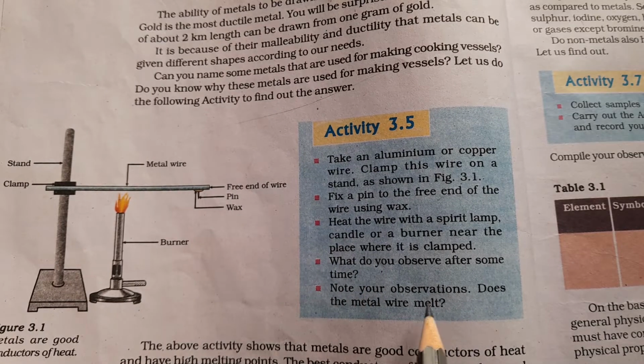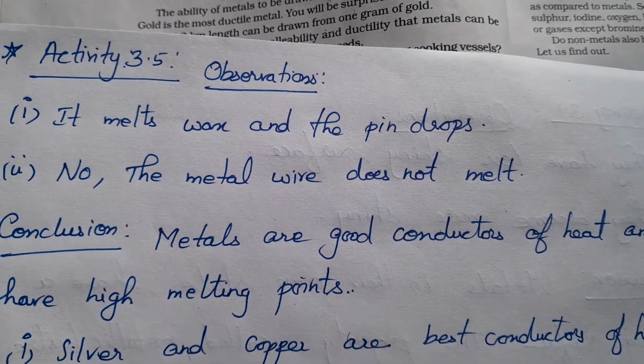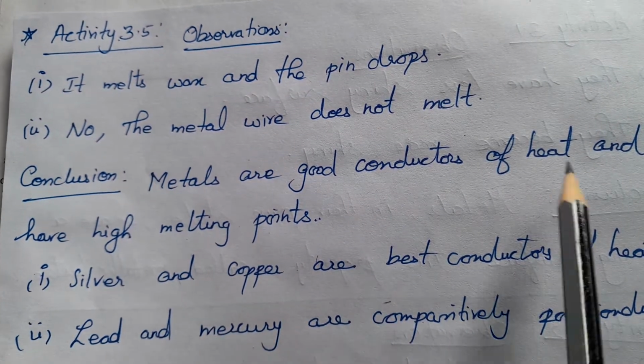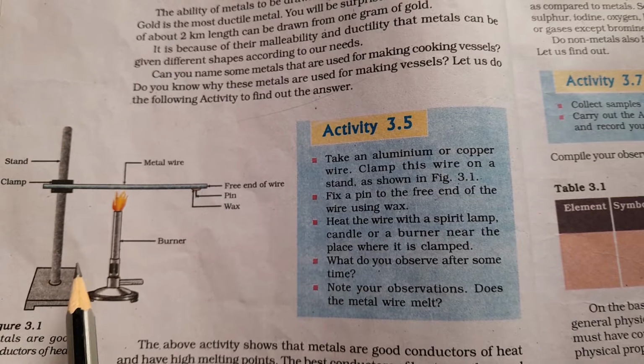Note your observation. Does the metal wire melt? No, the metal wire does not melt, okay. That means what is your conclusion from this? Metals are good conductors of heat. This wire can conduct this heat, right?